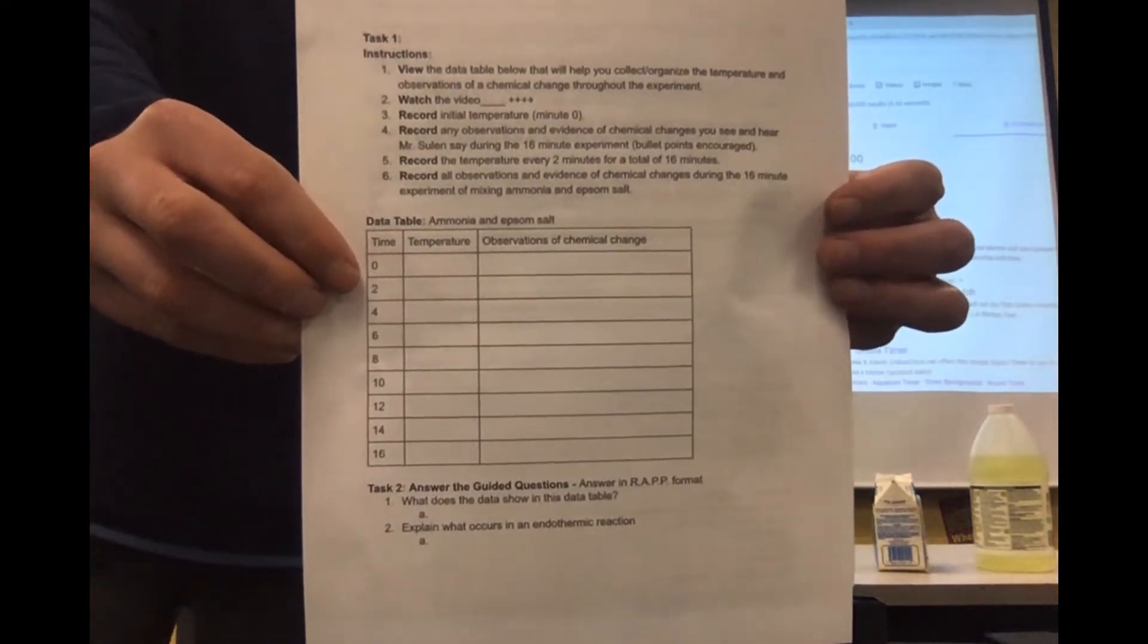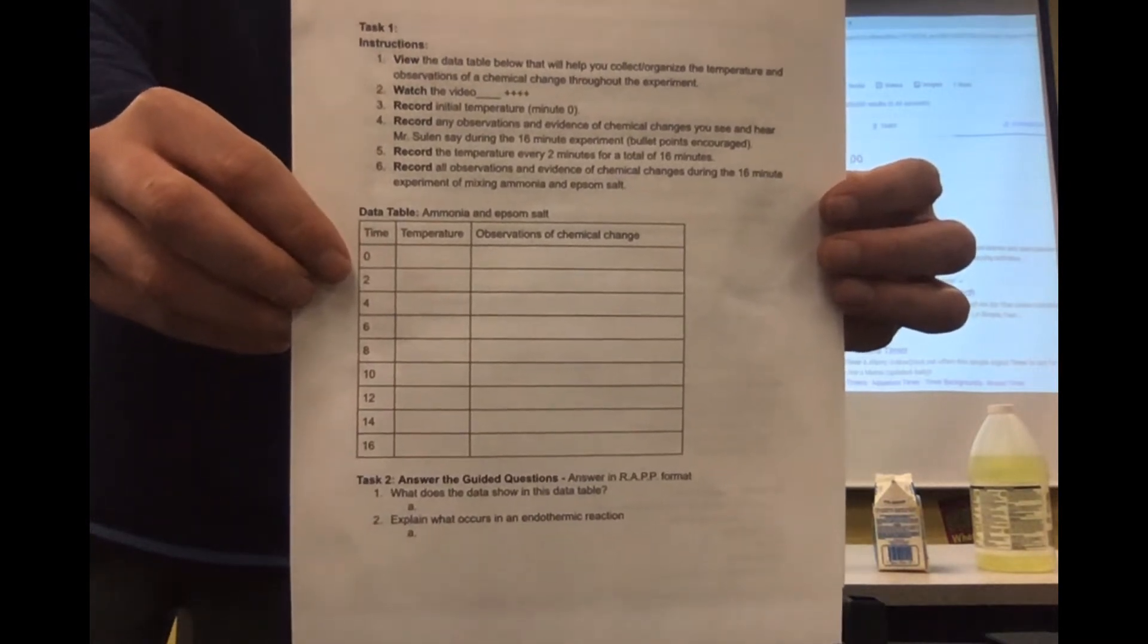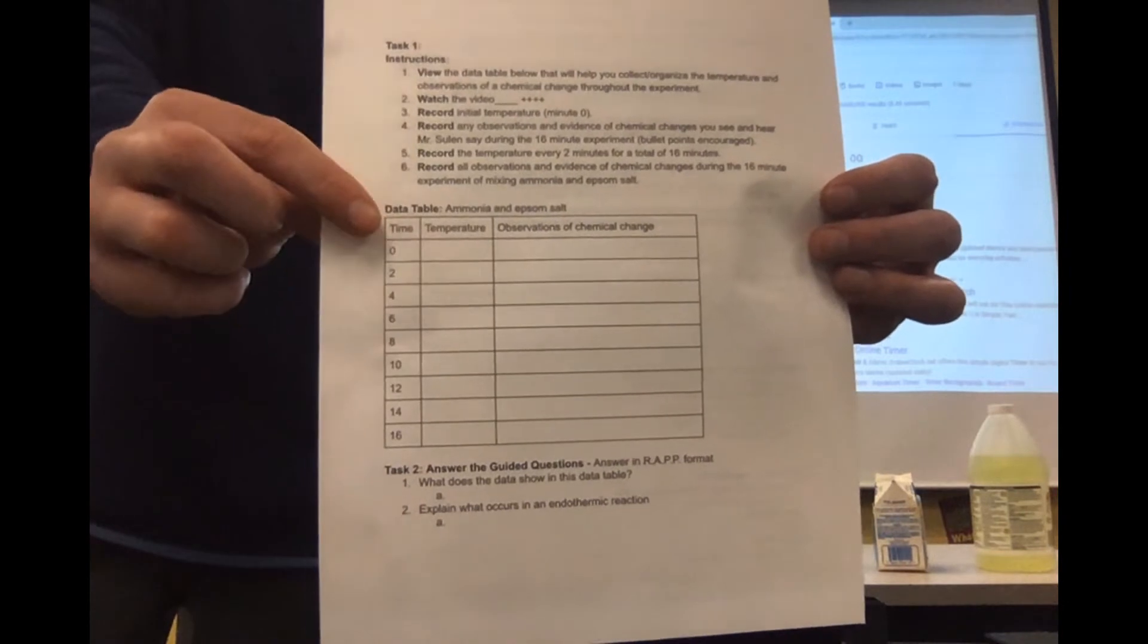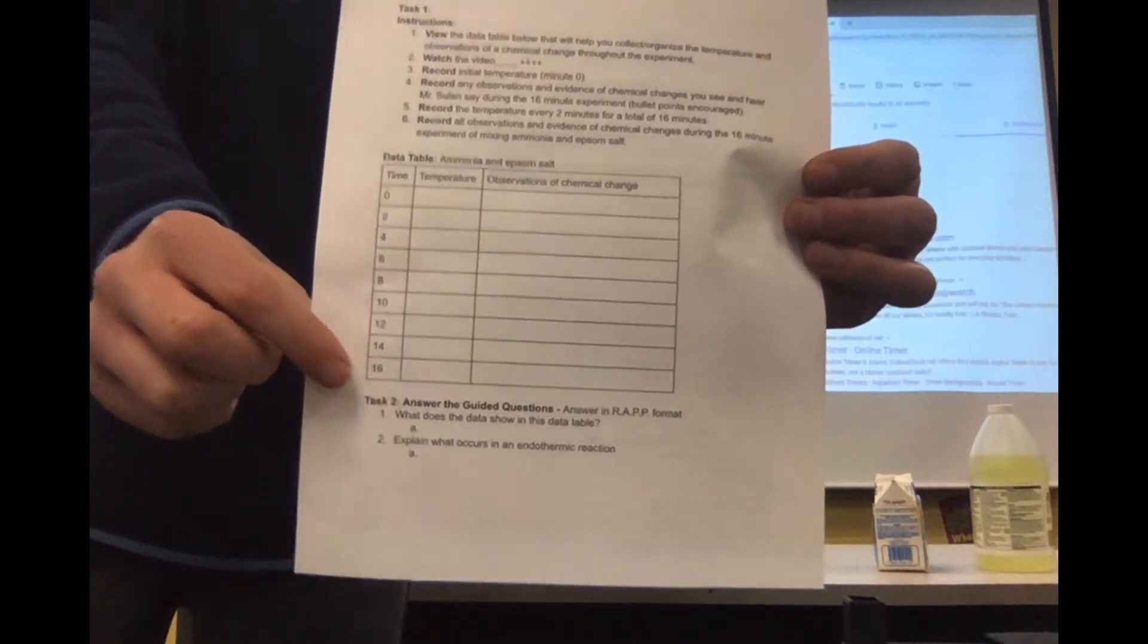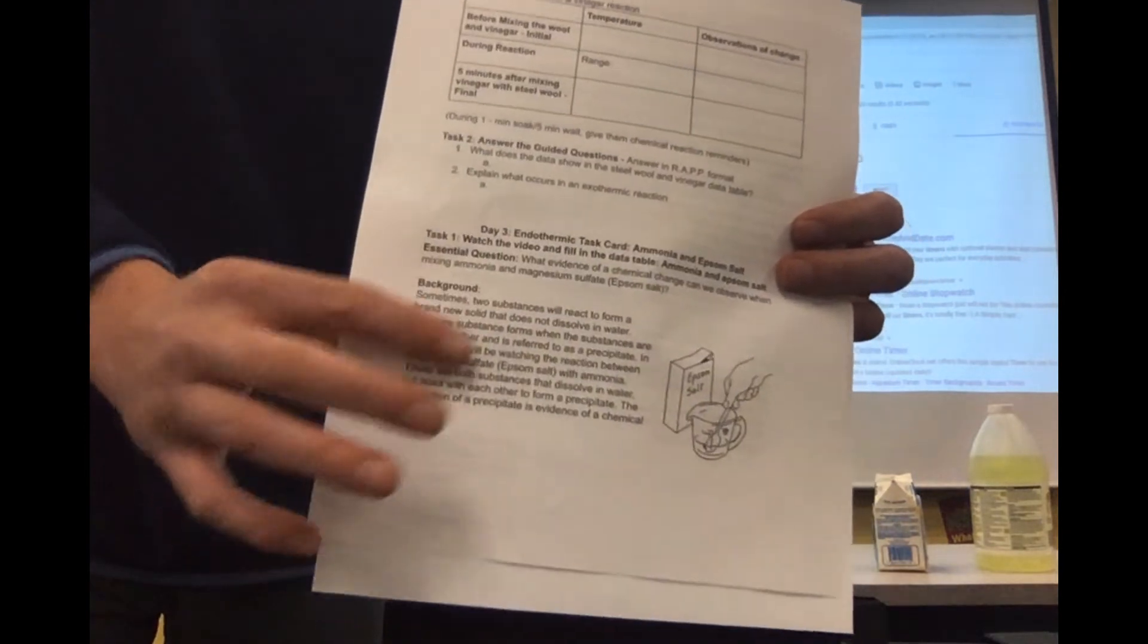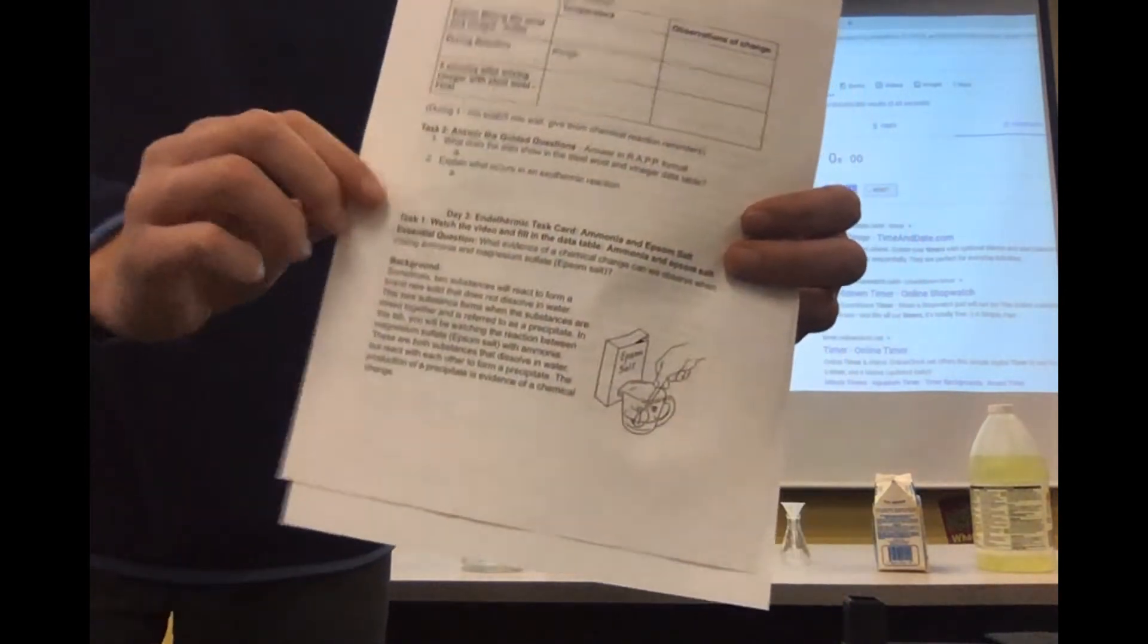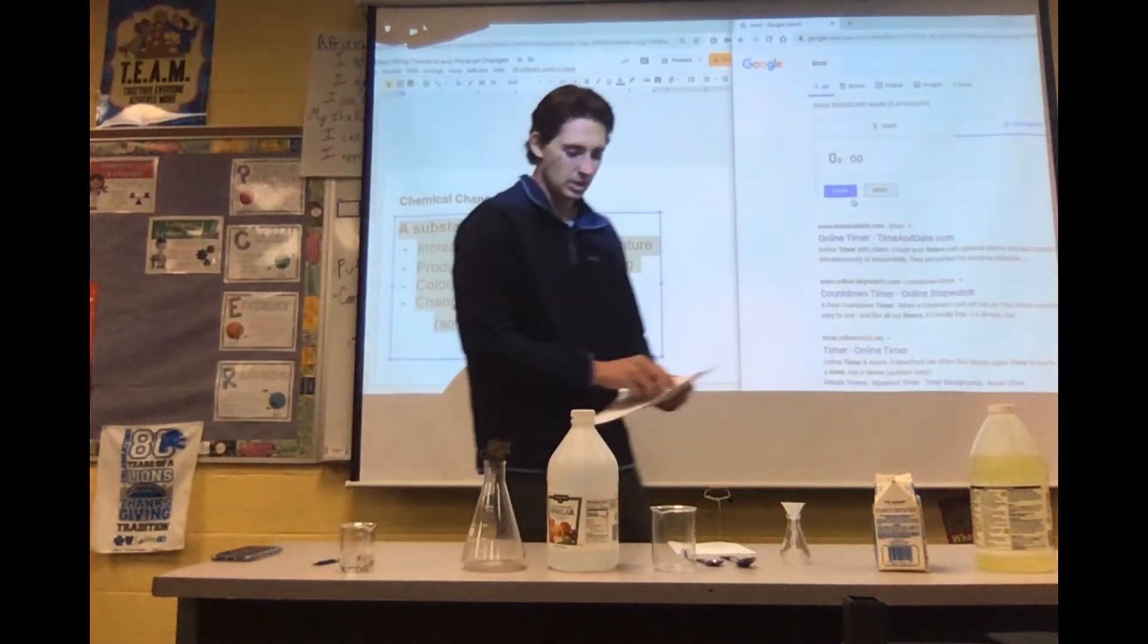Essential question: what evidence of a chemical change can we observe when mixing ammonia and magnesium sulfate or epsom salt? As you can see we start the data table at minute zero, the initial temperature, final temperature is 16. Once every two minutes we are going to be taking the temperature of our reaction. Make sure you are reading the background information right here next to the little picture so you have a really good understanding.